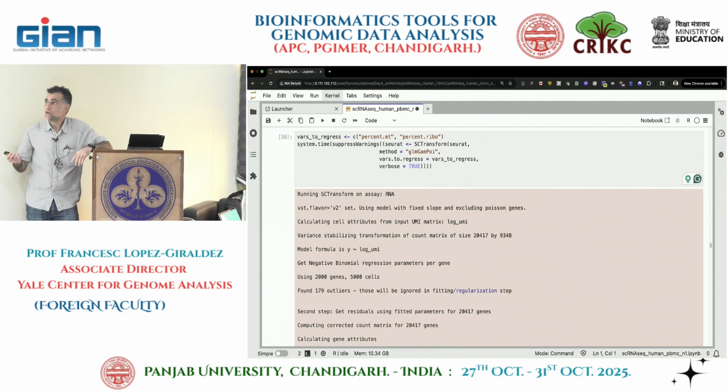So for example, for the UMAP, I've done a recent analysis with T cells. They already knew what T cells they were working with. They didn't care about that, and the clustering was just a group of T cells, subtypes and all that. They wanted to see how the drug they were using was affecting the T cells, and they wanted to see some separation of different subtypes. So what we ended up doing is, for clustering only, we decided to remove certain T cell markers that were driving the main clustering.